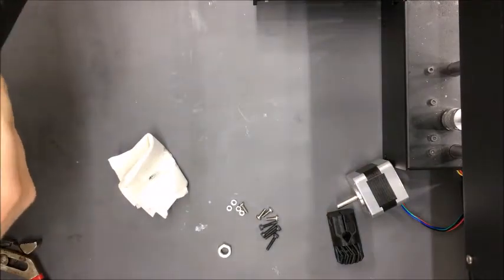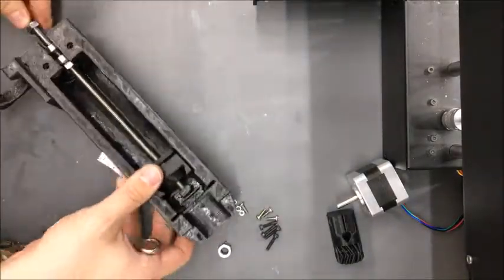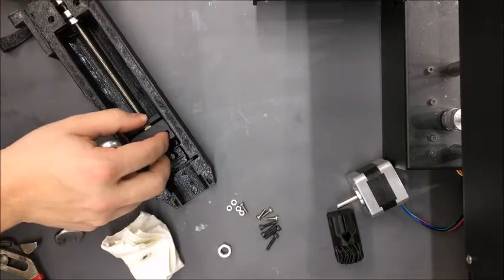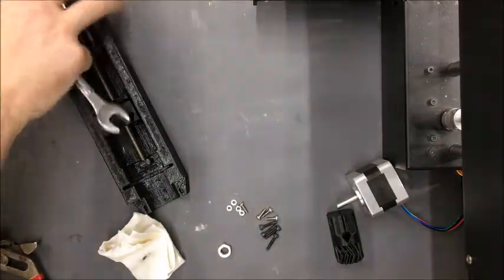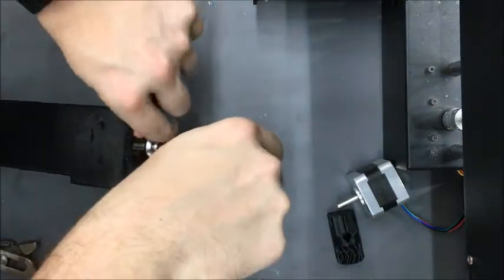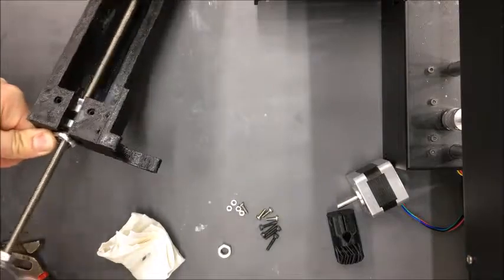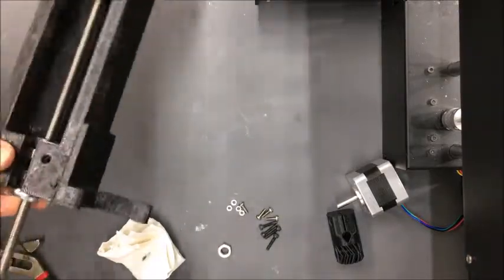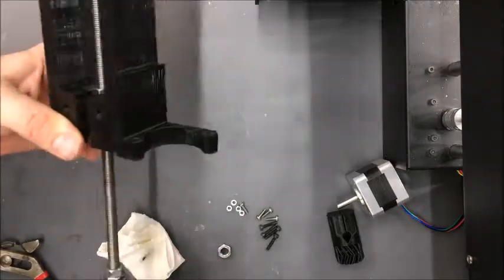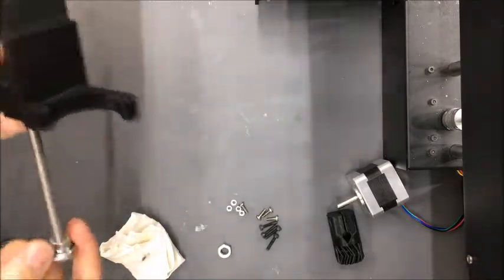One thing to be careful of when tightening is that the carriage can travel along the lead screw's length if you're not paying attention. Make sure the carriage has plenty of distance to travel before going back to tightening. When you get it very close, don't over-tighten — you'll squeeze the plastic and break something, which will ruin the whole function of the pump.